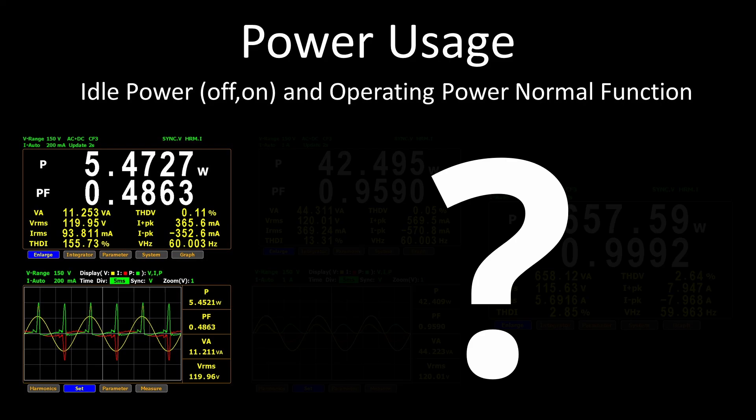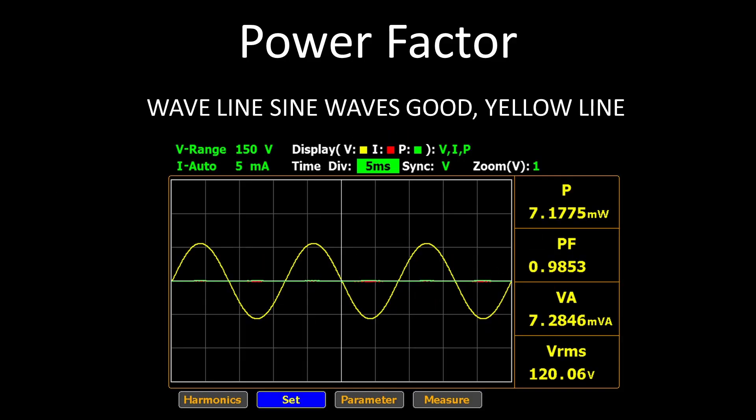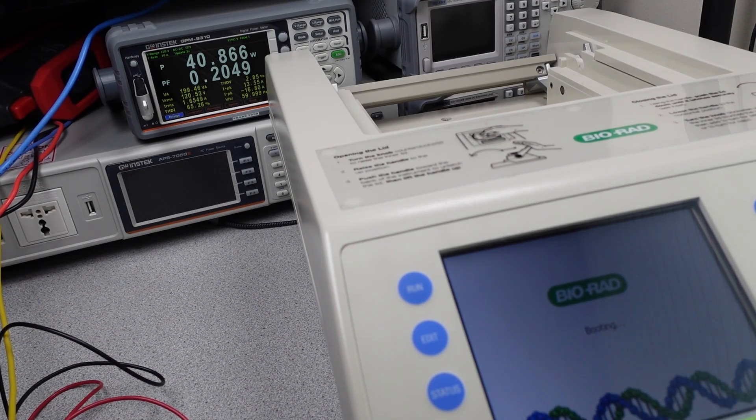When the machine is powered on, the power consumption jumps up and we can start to see some of the fault. The voltage rails were all checked and everything looks okay, so the machine was in a steady state. When looking at the power consumption on the power analyzer though, the current is very high and the power factor is very low, and you can hear the machine ticking. Power factor correction is a technique to consume AC power as efficiently as possible. The higher the power factor, the lower the comparable current, and therefore the lower the loss in wires and transformers. The goal is to have all the waves look the same shape as the sine wave. The machine definitely has power factor correction, but the graph gives us a hint into what is going wrong — the power factor circuit is failing to stay powered on.